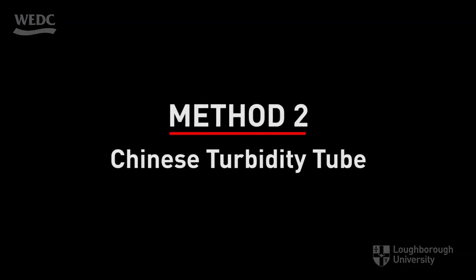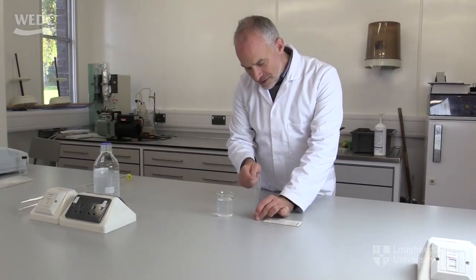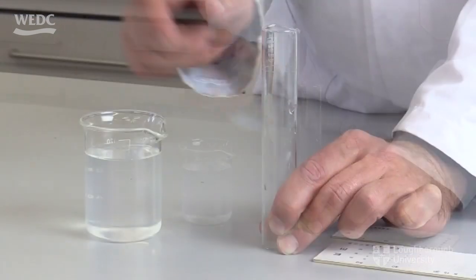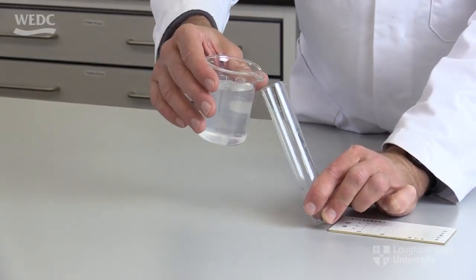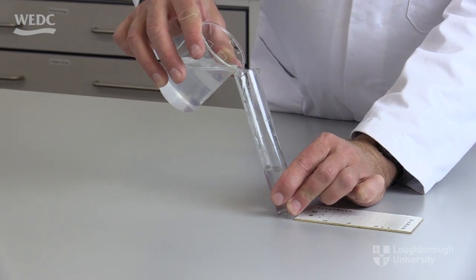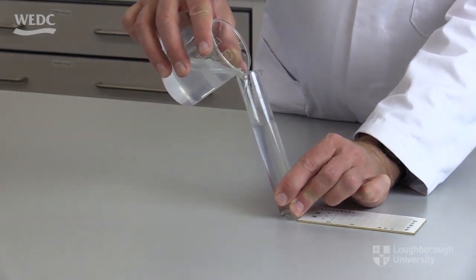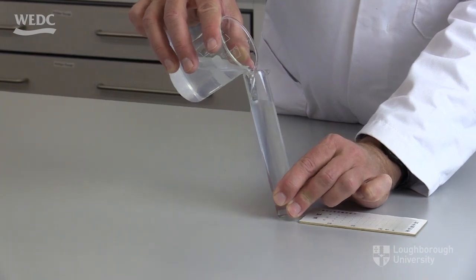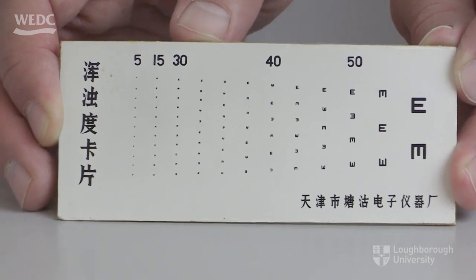The Chinese turbidity tube is slightly different in that it uses a standard depth of water rather than changing depths of water. The advantage here is that the tube can be much smaller than the conventional turbidity tube, although it may be less accurate. If the water is very turbid, it may not be possible to read any characters, and if the water is very clear, it will be easy to read even the smallest characters.